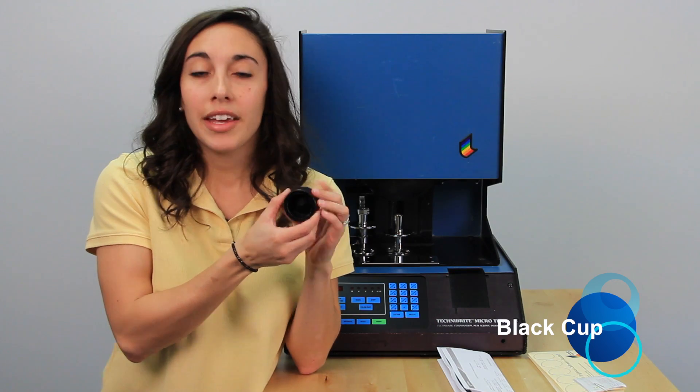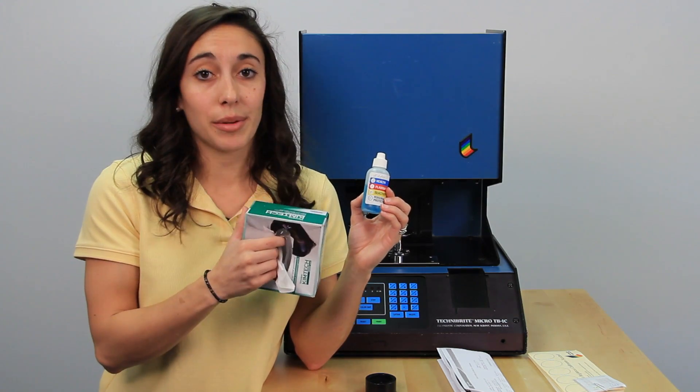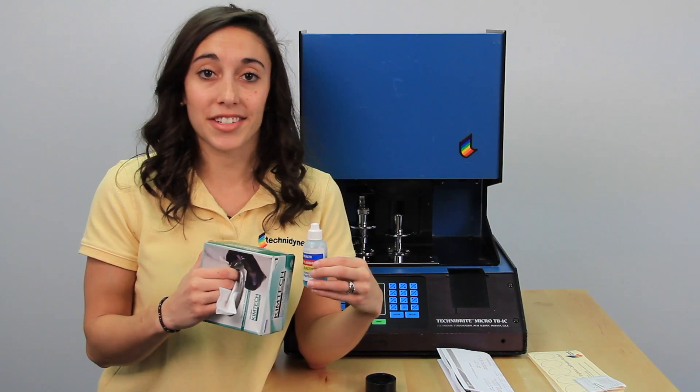The next thing that you'll need, which came with your instrument, is your black cup. And finally, just to verify that your swinging standard stays clean, we suggest that you have a cleaning solution and a non-abrasive, non-optically brightened cleaning wipe. Once your instrument is warmed up and you have everything together, we're ready to go ahead and get started.